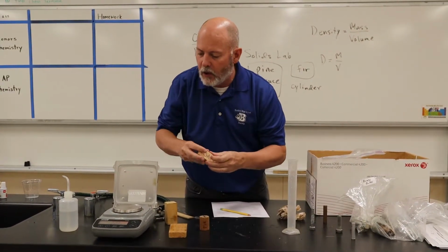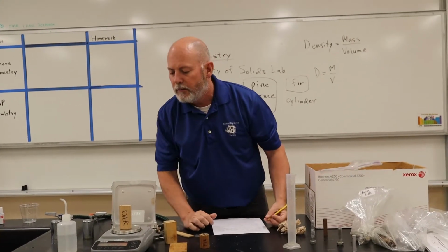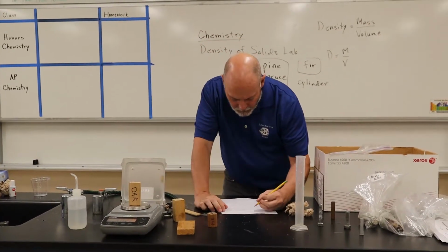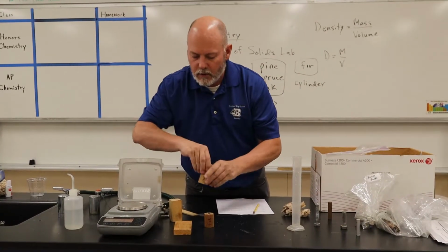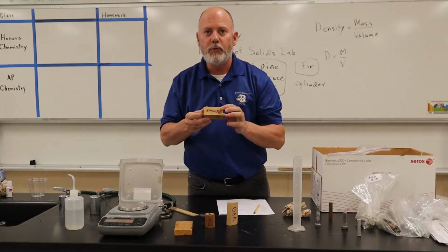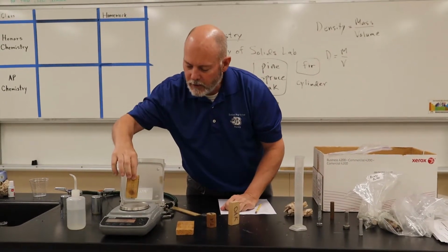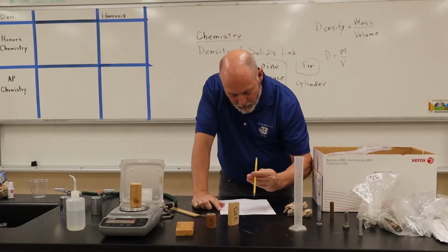Okay, the oak, let's zero that out. The oak is 41.51 grams. The spruce is 48.13 grams.